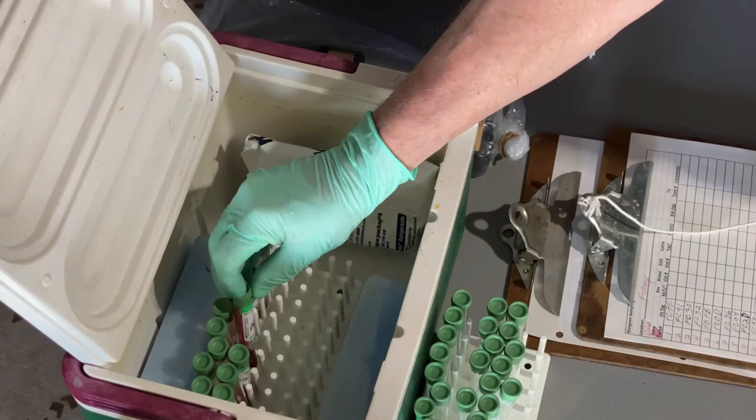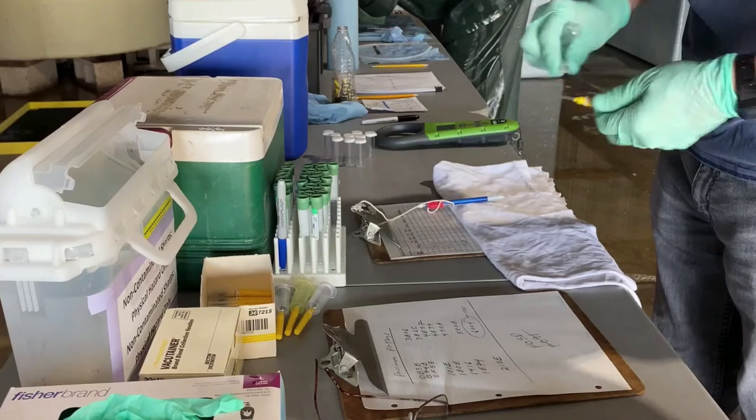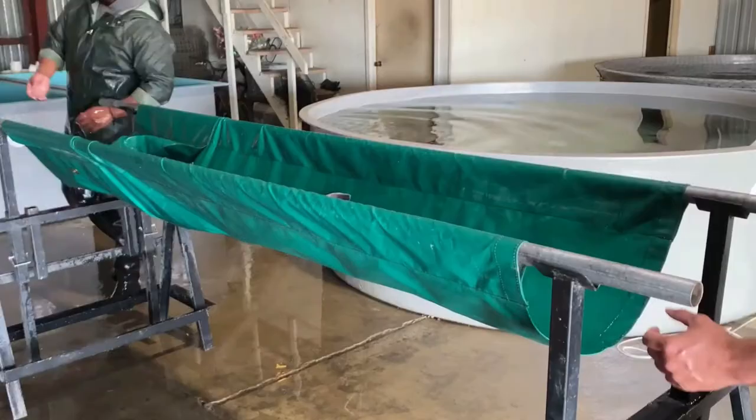Place the blood sample into an ice chest with gel packs or wet ice. It is important to note that the blood cells of fish will degrade if not maintained at a cold temperature. Do not recap the needle — just dispose directly into a sharps container.